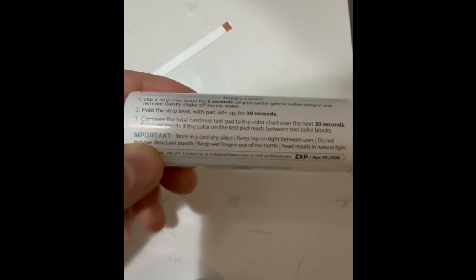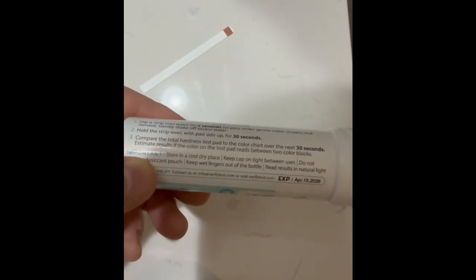So that's it before, and then we'll go ahead and do a test for after. It does say to estimate the results within 30 seconds. And obviously you want to store these in a cool, dry place. Make sure they don't get wet in between uses.